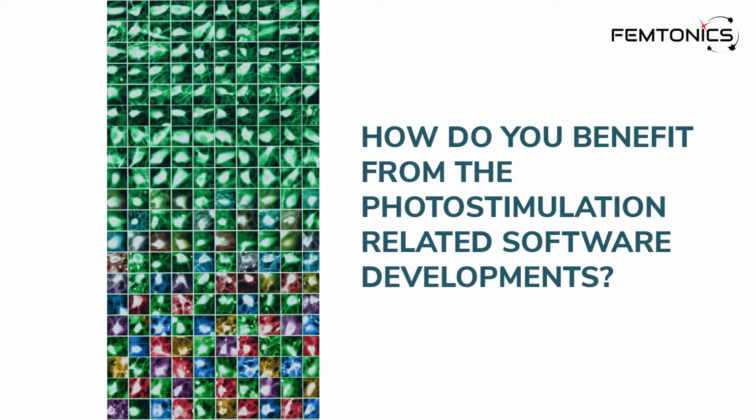How do you benefit from the photostimulation related software developments? We think and believe that this is an area where I think we're going to see really exciting results in the near future: to use optogenetics now in a targeted way to stimulate or inhibit identified elements of the neural circuit.